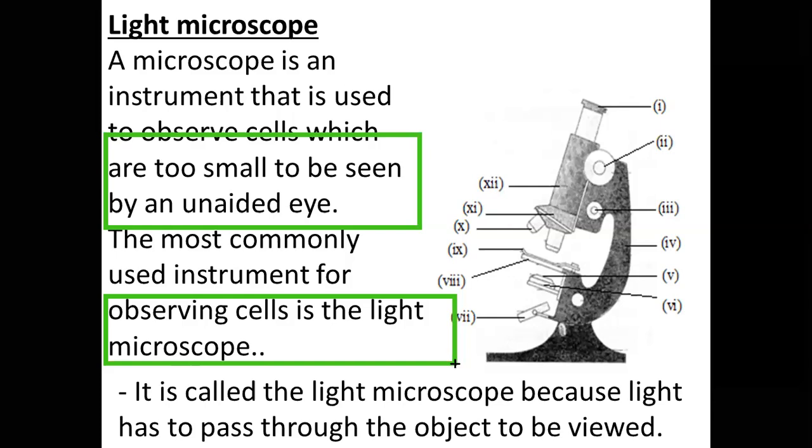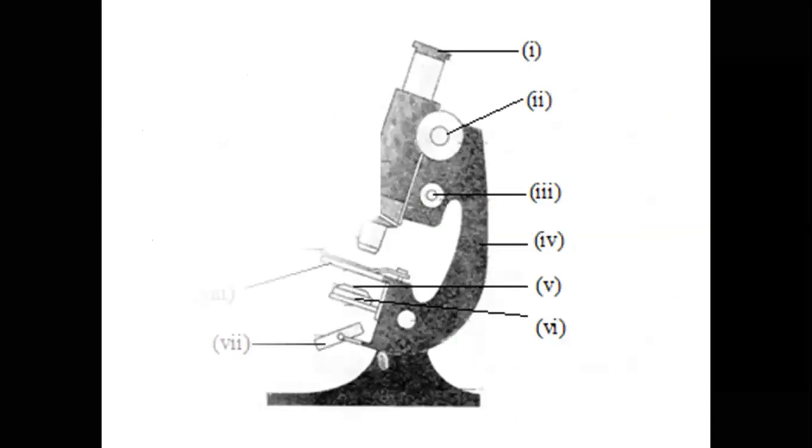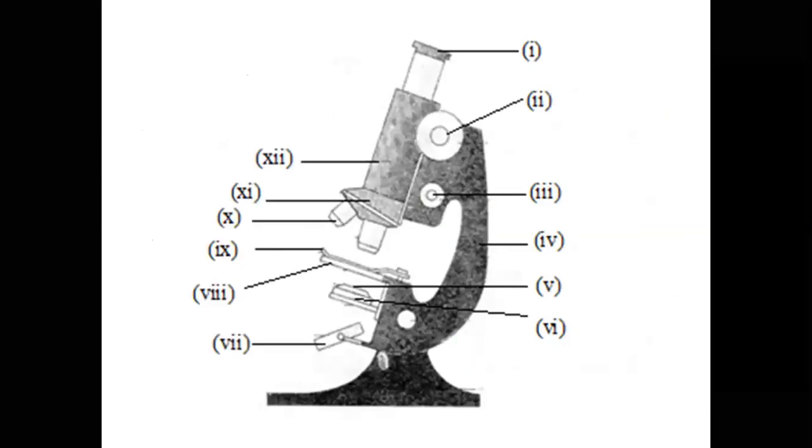I saw agony in students in 2014, when students were given a microscope in KCSE, and you would see students struggling. They would see darkness. Maybe that is something that we want to emphasize, that anytime you are given an opportunity to use a microscope, the first thing is lighting. Make sure that it is well lit.